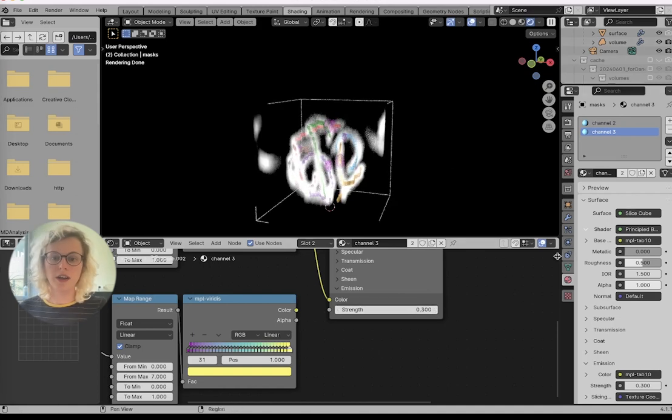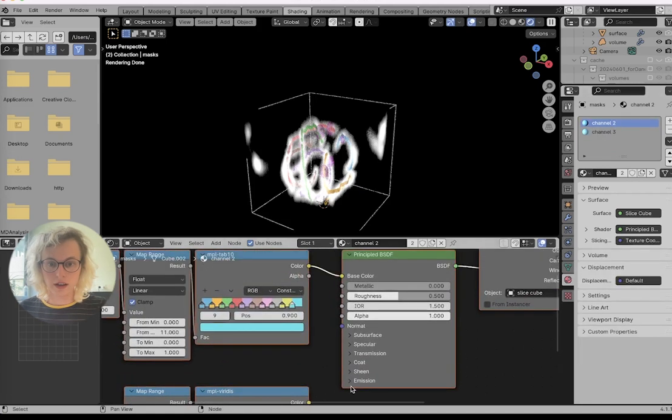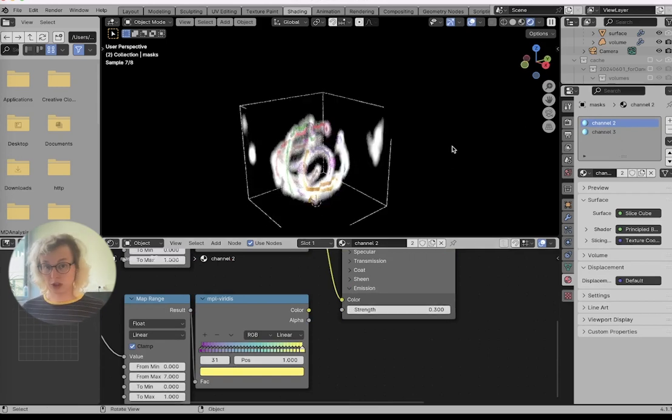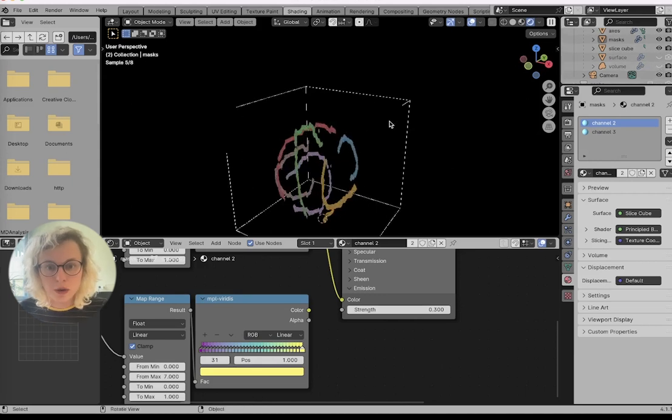And similarly, we can do this for our single spots. But we also cannot really see the single spots. So now we're going to do something a little bit more advanced and a little bit more specific for this data set, but I think it's nice to see that these things are possible. So I'll quickly turn off a few things to make it a bit more visible. So we have our single spots over here, and they're really hard to see.